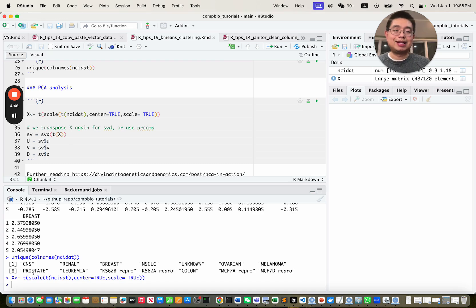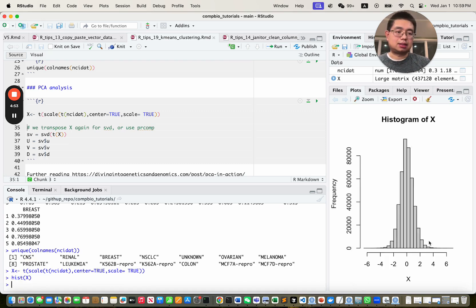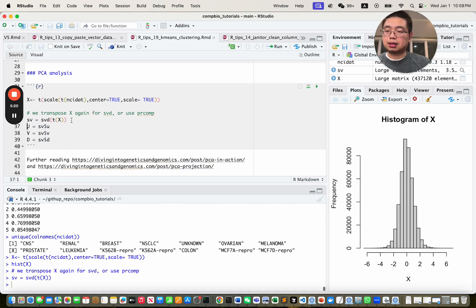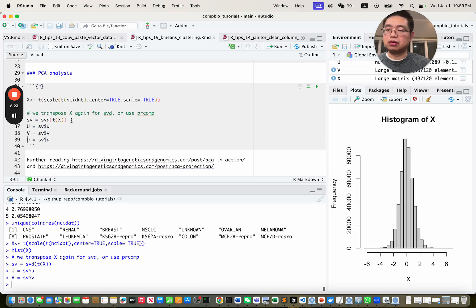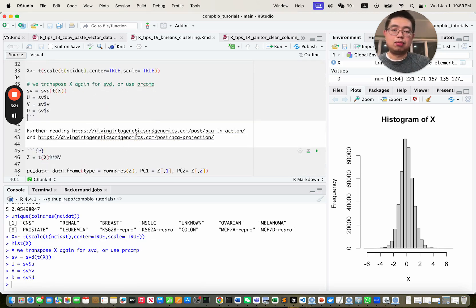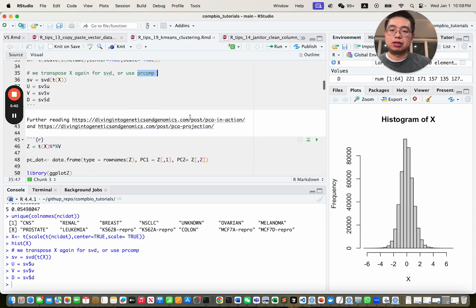If you look at the distribution, it has a very nice standard normal distribution after scaling. Now we do PCA using singular value decomposition (SVD). We transpose the matrix first, then get the U, V, and D matrices. If you don't understand SVD, I have two blog posts that dive deep into this topic — what is PCA, using SVD in R, or using prcomp in R; both give the same results. The Z matrix is the transpose of X times the V matrix — this is the principal component matrix.